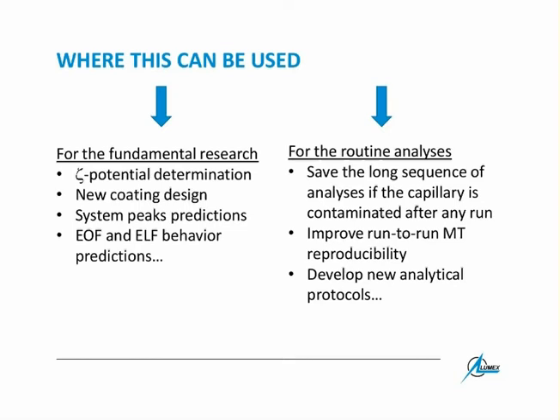For example, could it be possible to use streaming potential control when performing chiral CE analysis? Definitely, yes, of course. The chiral analysis is a very important part of CE analysis, and you use a special chiral additive to the buffer in order to separate isomers. D or L isomers, for example, optical isomers.